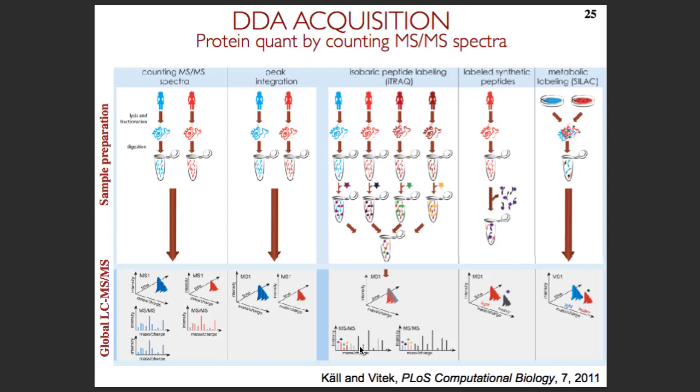We may not have data for the same protein in every run, and if we have data for this protein, it can actually come from different peptide ions in different runs. And we have very little control on that, and we have to work with the fact that we'll have different peptide ions in different runs, and we will have missing ions in some runs.